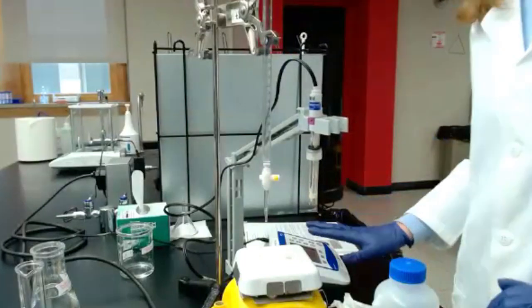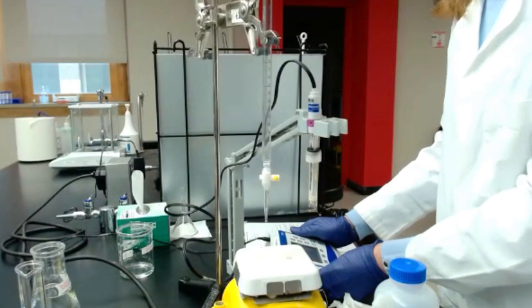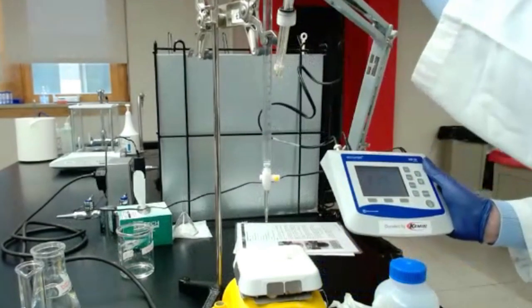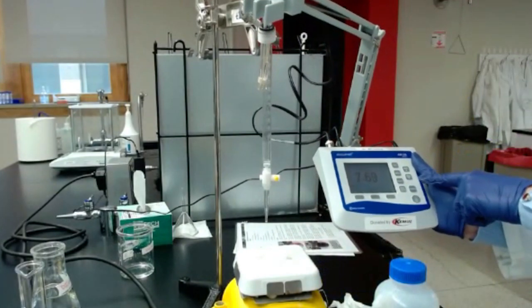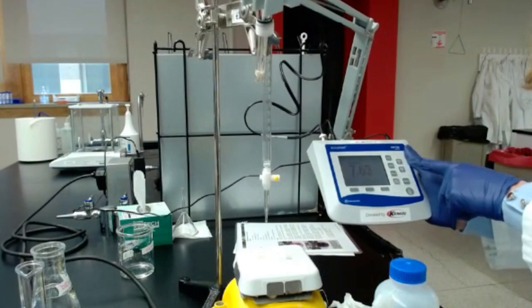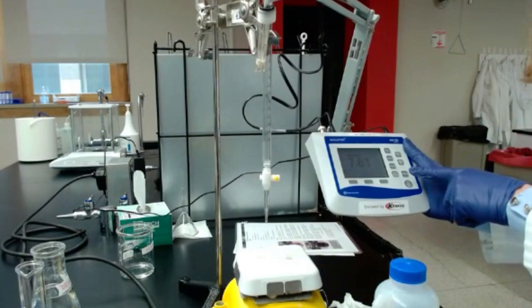On your pH meter, you should have a way to see, I can try to show you. So that's the pH meter. You should have a lot of different buttons. One of them would be either standardize, STD, or Calib, or Cal, C-A-L.